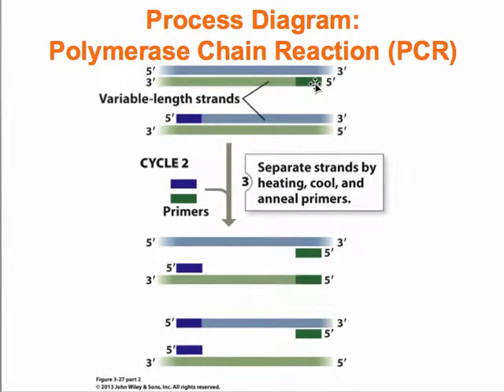Our enzyme is going to run and base pair these nucleotides all the way down the length of the DNA. Then we heat our reaction again to a very high temperature, and all of these strands that we've just made, here you can see is that primer again, and here's the original template, they are going to separate, and the reaction will carry out again. I think a video is worth 1,000 words, so we'll check out a video.